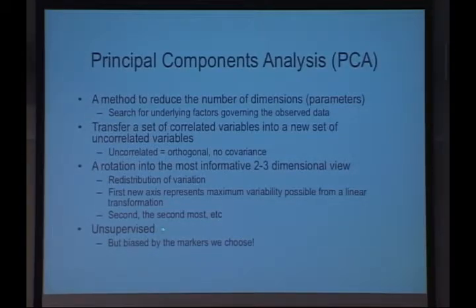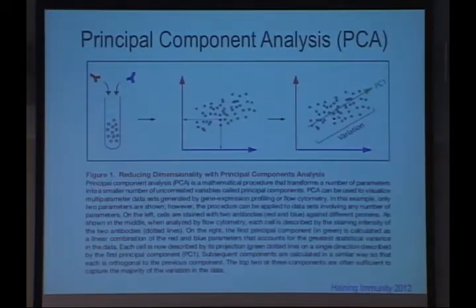And then also, it's important to note, like the other analysis methods, it's unsupervised. But of course, it's biased by the markers we choose to put in there, because if you put in different markers, you're going to get completely different information, obviously. I put this in here for you to read. It's another way of thinking about it.